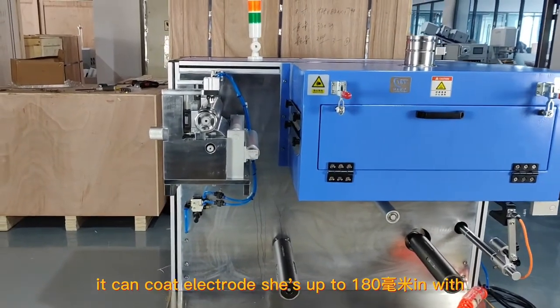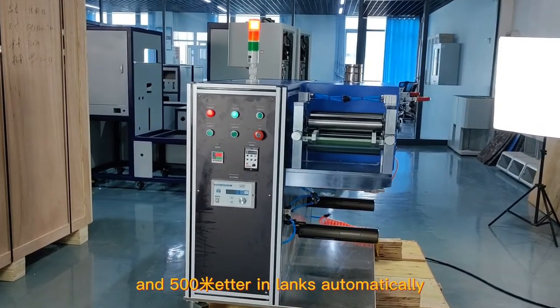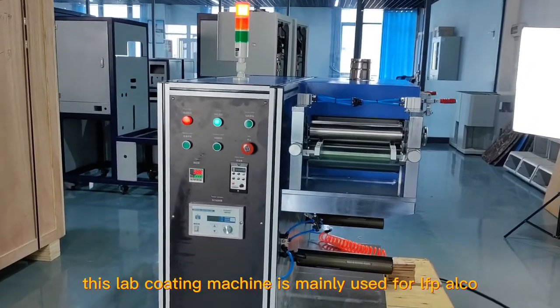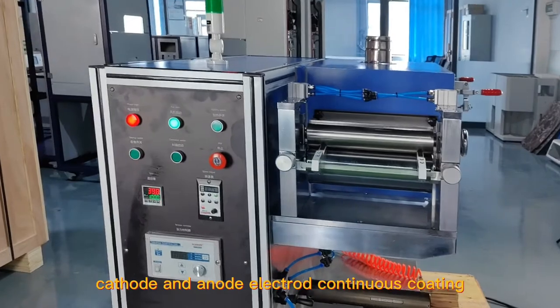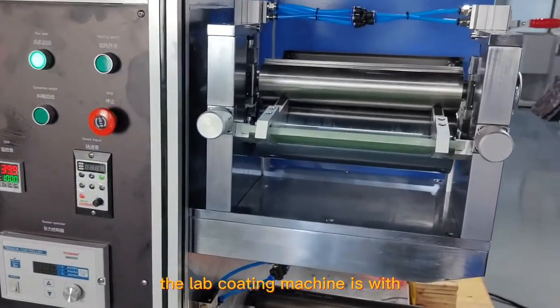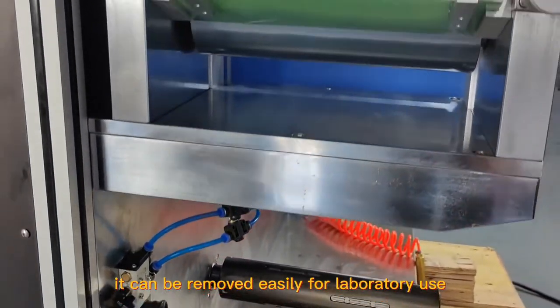It can coat electrode sheets up to 180 mm in width and 500 mm in length automatically. This lab coating machine is mainly used for LFP, NMC, and NCM system battery cathode and anode electrode continuous coating. The lab coating machine has four-direction wheels on the bottom, so it can be moved easily for laboratory use.